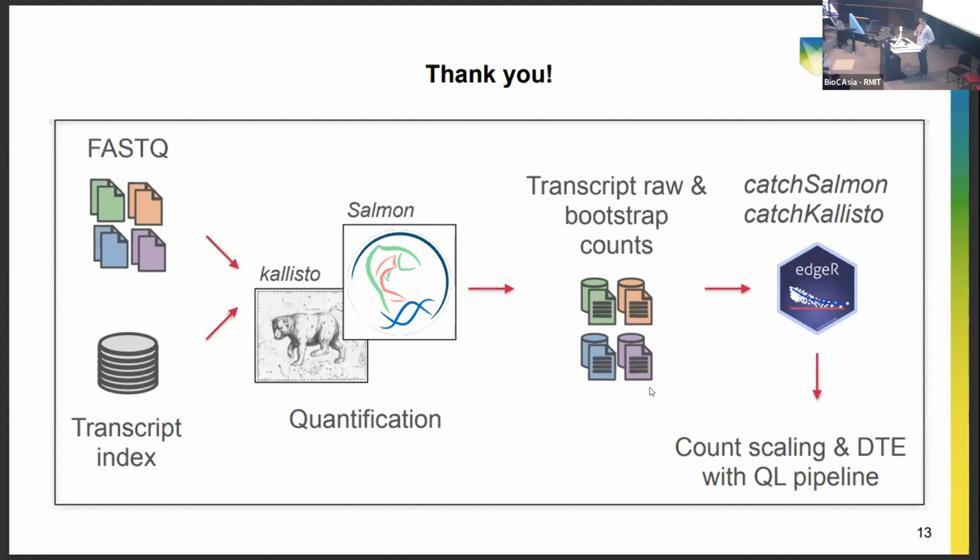Yeah, I'm not sure. So if we compare the analysis with the count scaling and without count scaling, I would imagine that genes that are expressing a single transcript would remain with the same significance. But for genes that have transcripts overlapping each other, we account for that variability. I'm not sure how the transcripts would move up and down with the count scaling. Sorry. We can chat about it later. I'm actually really curious.